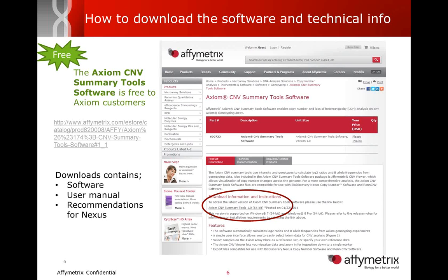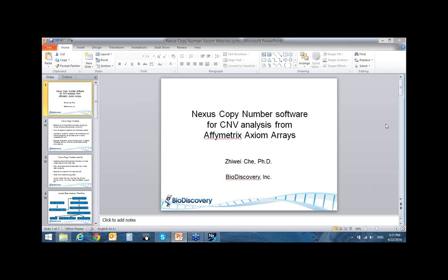Thank you, Mary Jo. Let me get this to my side. I have a PowerPoint presentation, followed by a live presentation of the software with the data Mary Jo sent over to me.